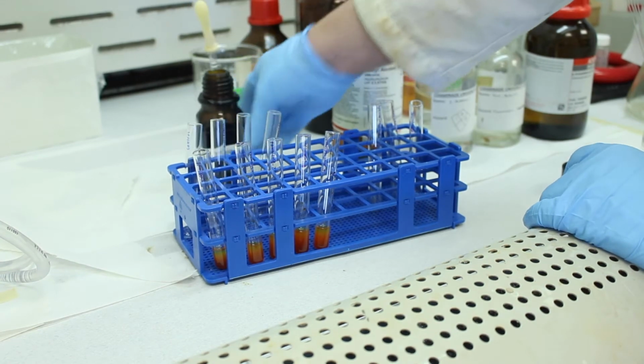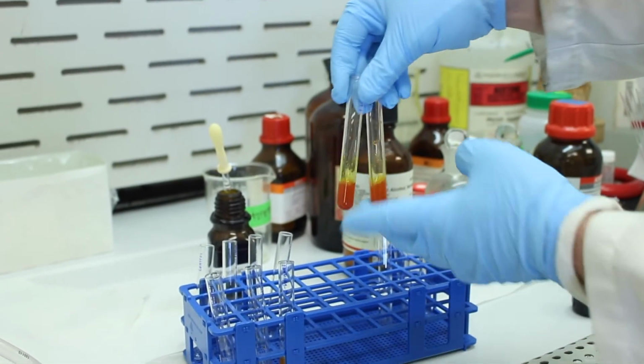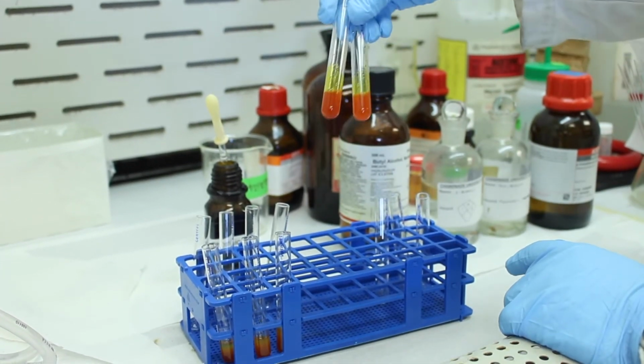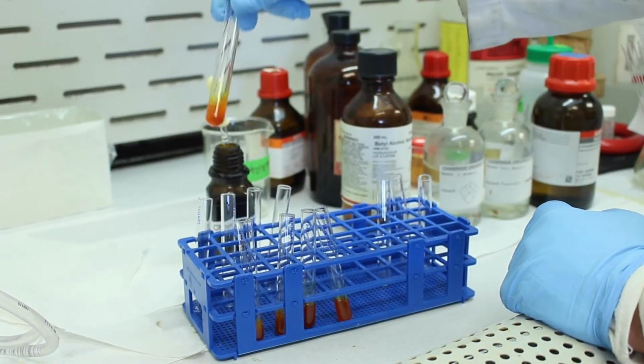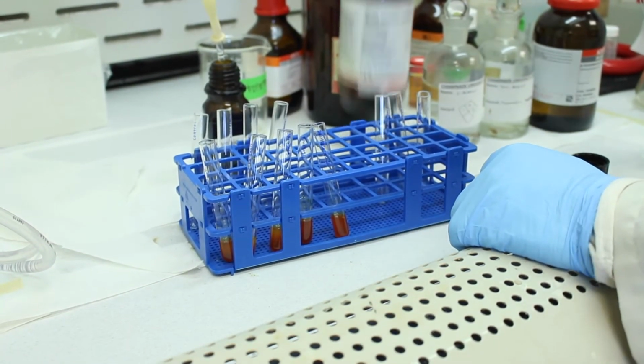Place that aside here. You can see that it's got a little bit of turbidity because the chromic acid is probably forming some chromium salts that are not soluble in the acetone. But what we're looking for is a transition from red to blue to green. So this is our control here. You can see it looks all the same. It's just all acetone and chromic acid. So let's go through our unknowns.